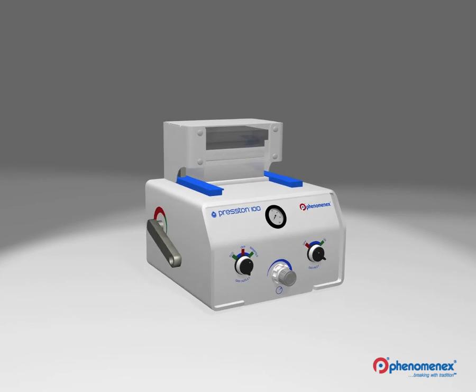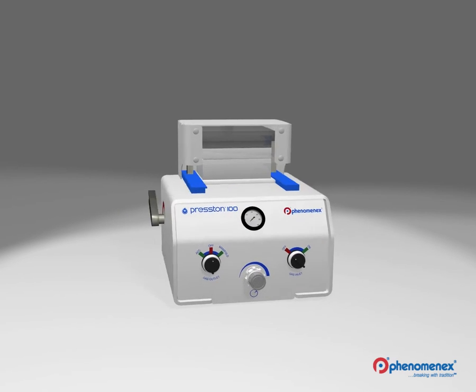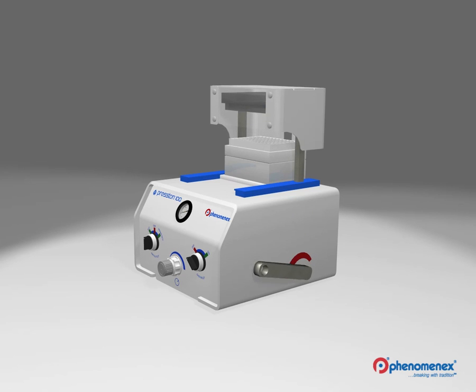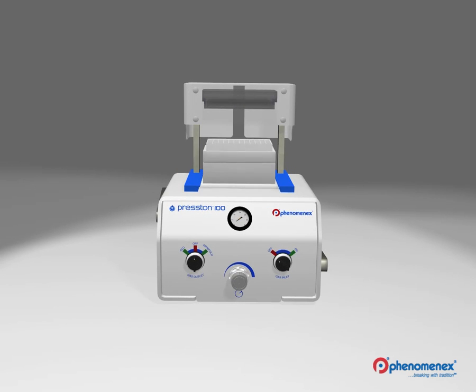Using the manifold locking lever, the seal between the manifold and 96-well plate or tubes can be broken. You can then move the manifold into the top position using the manifold positioning lever. Your samples are now ready to be removed by sliding the locator plate out.